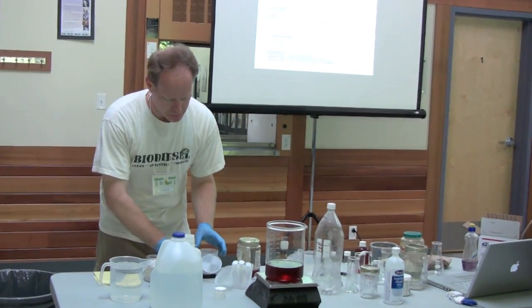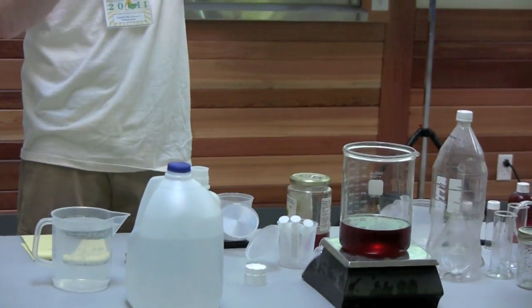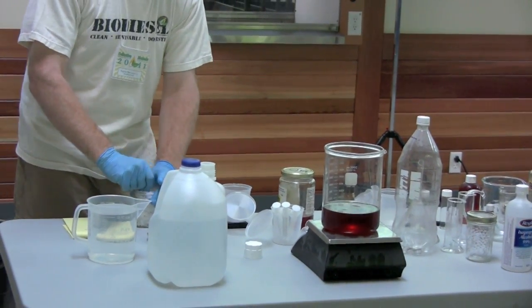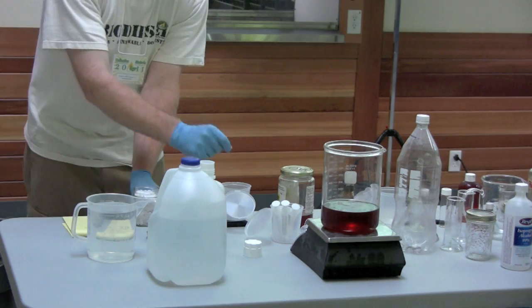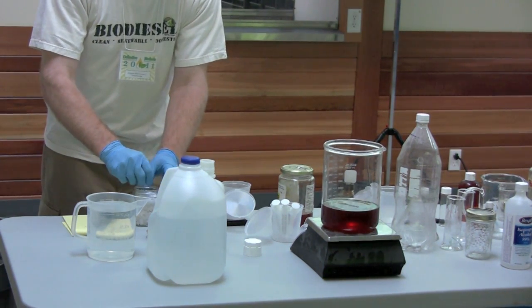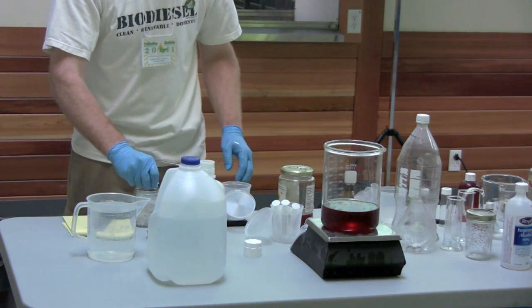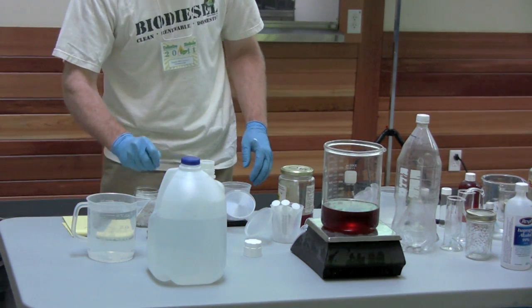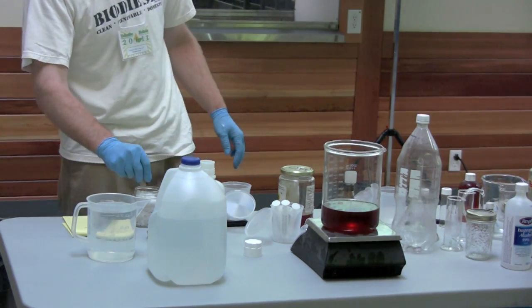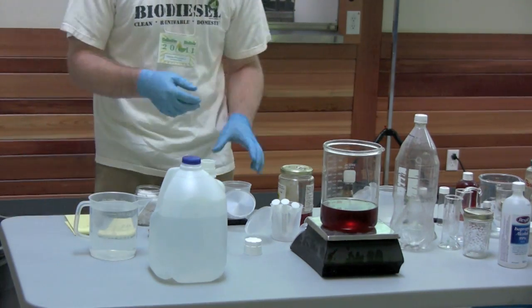So I'm using a cup to do this just because it's easier, and I've got gloves on. Whenever you play with the caustic itself, gloves on. This is pretty nasty, it does burn. And all I'm doing now is I'm just going to measure out 1 gram. If you have high humidity in the area that you're doing this at, it's a good idea to do this inside in an air-conditioned room. The reason is this stuff is so reactive that it will absorb the water right out of the air.